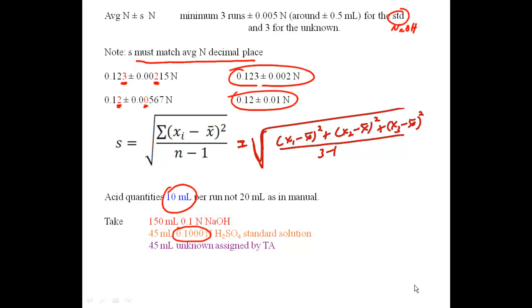I want you to have enough of a procedure that you could reproduce this experiment or hand it to somebody else to do again. Now, when you do the second run, you can just say procedure done just as well as the first experiment, except X grams, a different mass of something or different size sample or whatever. But basically somebody needs to be able to reproduce this experiment from your notebook.